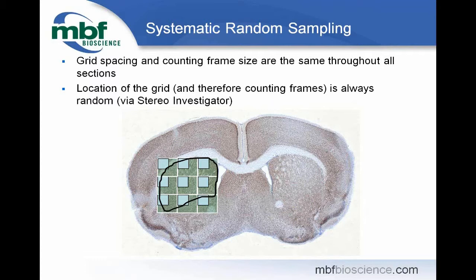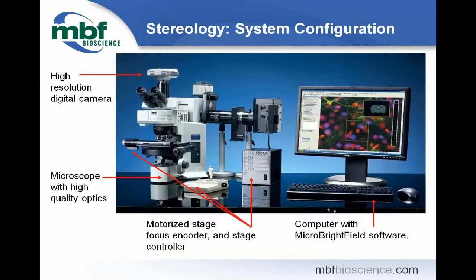Acquiring an SRS image stack series requires specialized microscopy hardware. Very basic hardware requirements include a high-resolution digital camera, a motorized stage capable of directing movements in X, Y, and Z axis, a computer running MBF software to drive all of the motorized components of your microscope, and critically, high numerical aperture objectives. Let me expand on the topic of aperture and objectives a bit more.